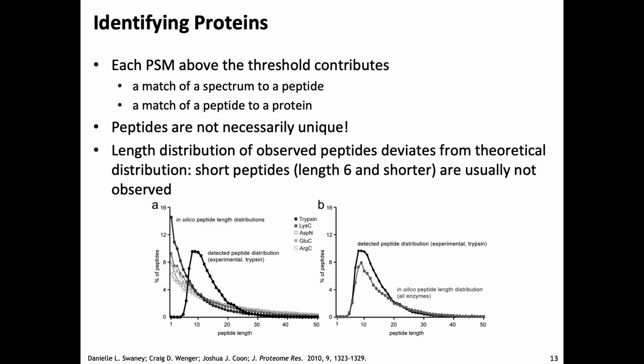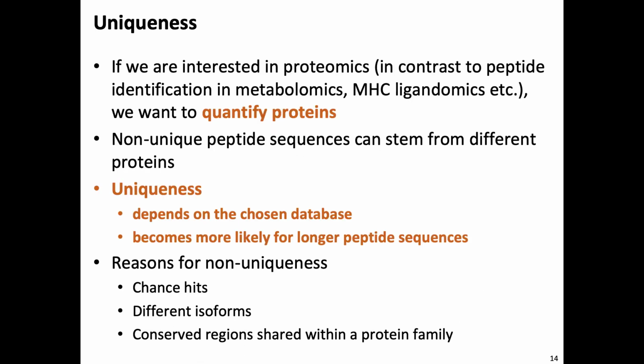So if you know that the sequence is AKK, what do you know? What did you learn about your protein? Nothing. So we filter at every step of the sample preparation, and also in the mass spec, we filter these guys out. They tend not to be unique. But we can look a bit closer at that.